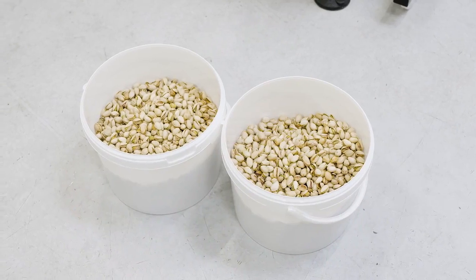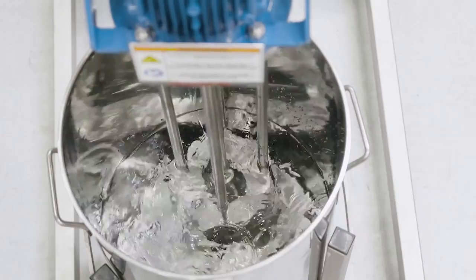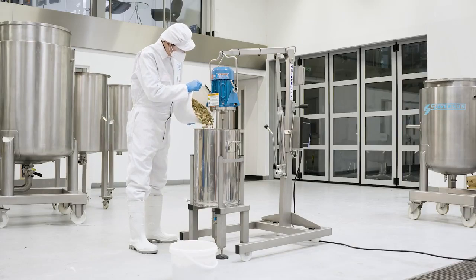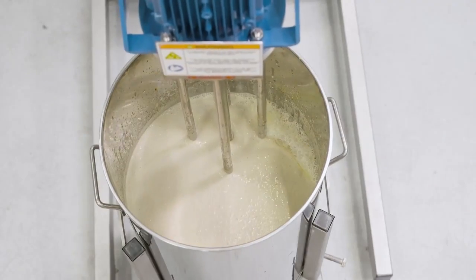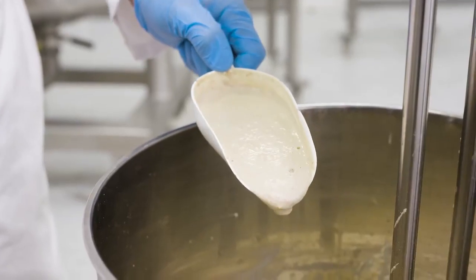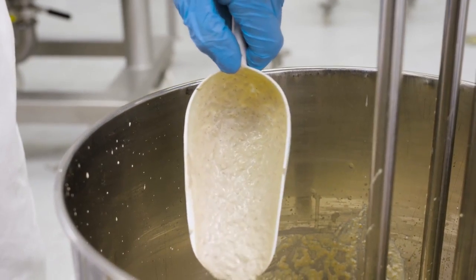Typically the sample — in this demonstration, pistachio nuts — is mixed at a 50-50 ratio with water. The high shear action of the mixer will rapidly disintegrate the nuts and form a homogeneous slurry with a fine, uniform particle size. The consistent results obtained with the Silverson mixer make the process easy to validate.